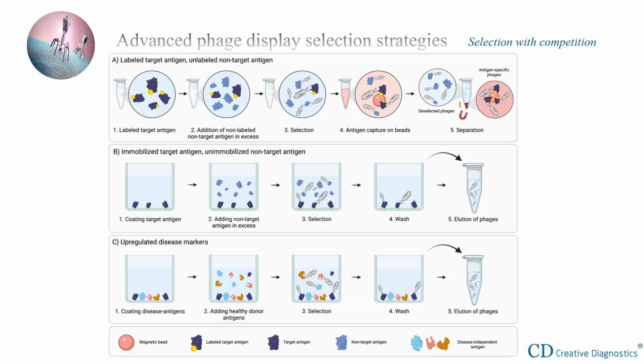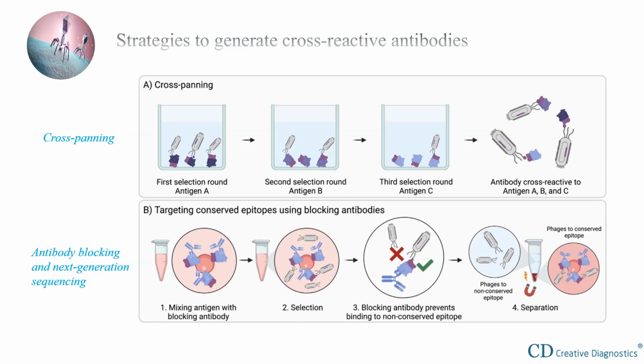Antibodies are highly specific molecules, and selection processes are usually designed to find antibodies that specifically bind to a single target antigen while avoiding binding to other molecules. However, in many cases, although antibodies must be highly specific to their target, it is preferable that they also bind to homologs or different mutated versions of the same target. For example, preclinical studies of a therapeutic antibody targeting a human antigen are much easier if the antibody also recognizes the murine and simian versions of that antigen.